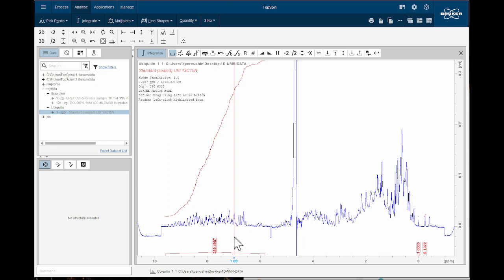So that gives me this huge integral, and now we have to retrieve the sequence of ubiquitin, the amino acid sequence of ubiquitin, and count the number of protons. So again, there should be aromatic protons and amide protons. So they all resonate here. That's a straightforward task, but it requires some analysis of the protein sequence.